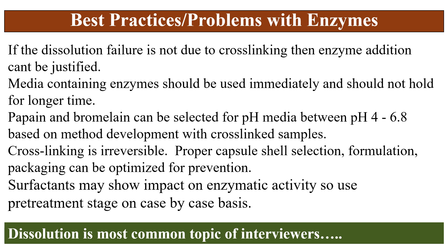Crosslinking is an irreversible and variable process — every time you cannot get the same degree of crosslinking. Therefore, proper capsule shell selection, formulation, excipient selection, manufacturing method selection, and packaging can be optimized for prevention. Some gelatin manufacturers claim that treated gelatins — such as succinated gelatin or fish gelatin — are less prone to crosslinking. These can be tried. Also, HPMC capsules can be tried so that there will be no crosslinking, depending on the type of formulation and requirements.